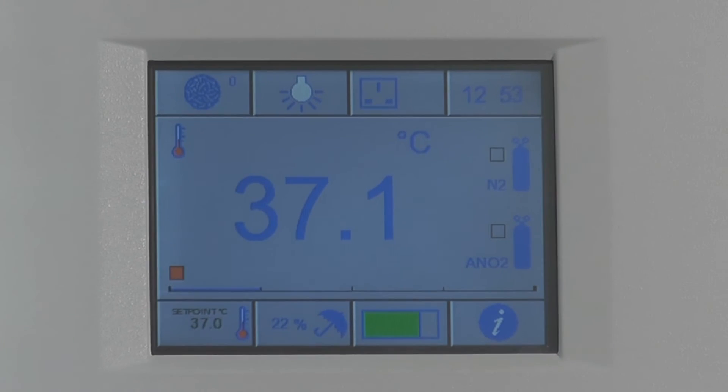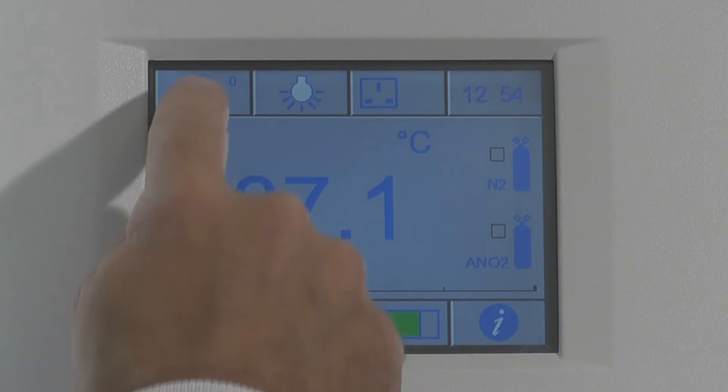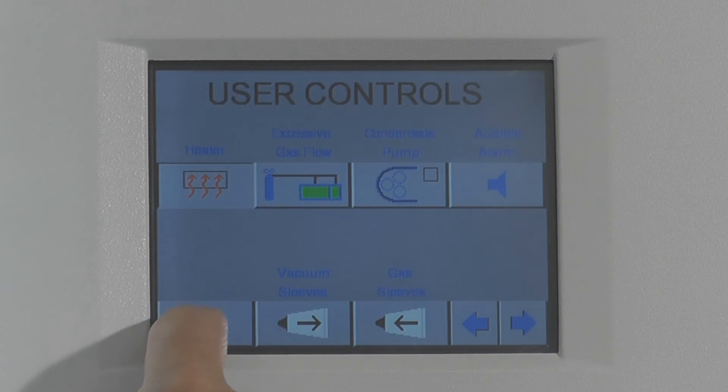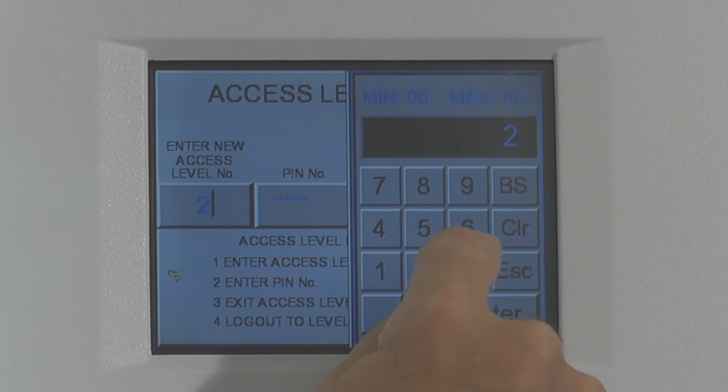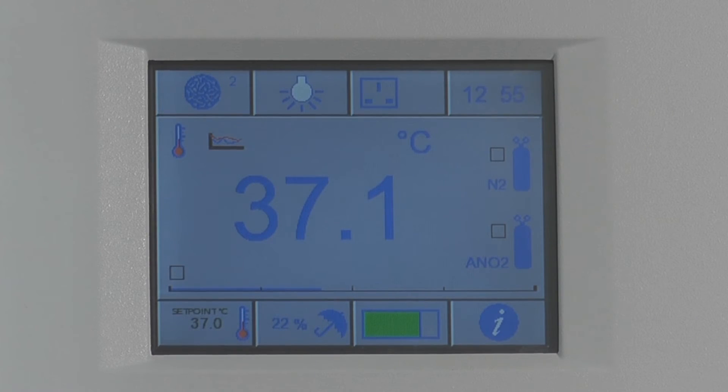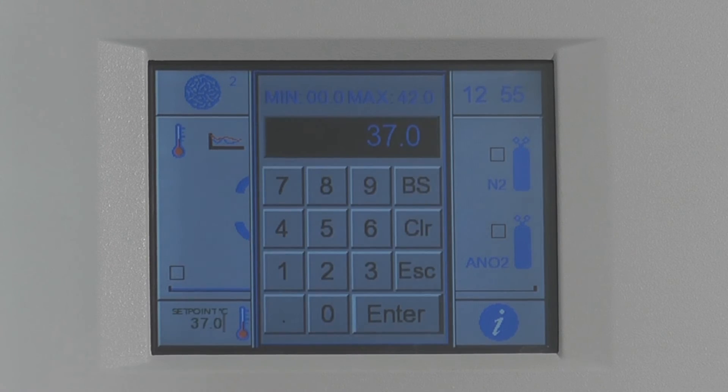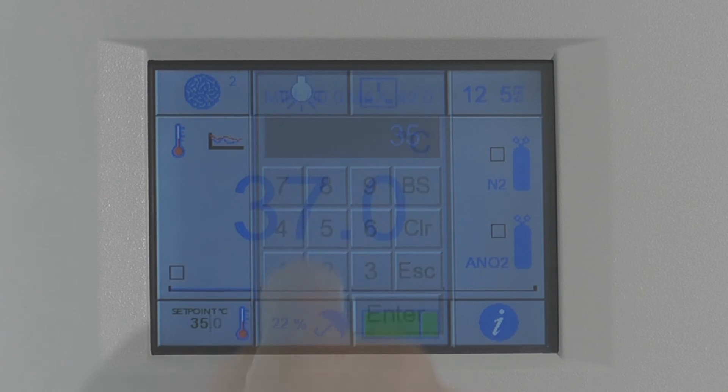The A35 utilizes an innovative touch screen interface with password protected user levels to prevent unauthorized changes to workstation conditions. Temperature and humidity are readily defined by the operator, and a history of workstation conditions can be seen at the touch of a button.